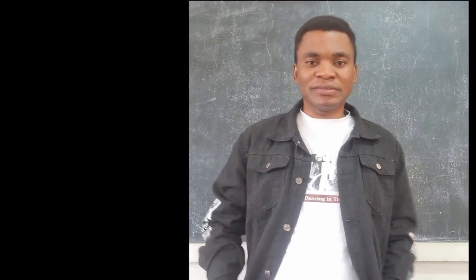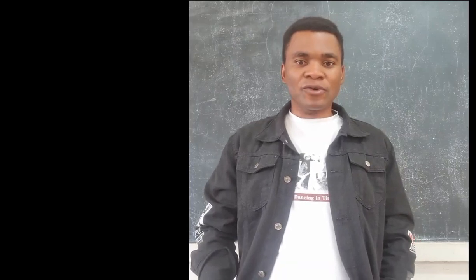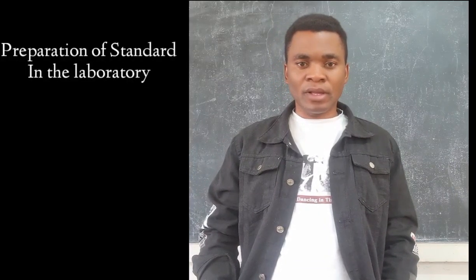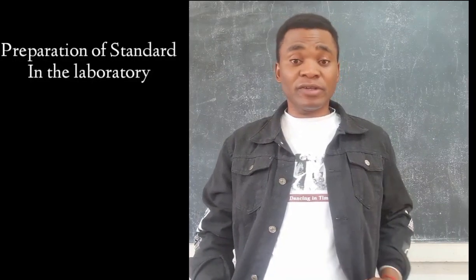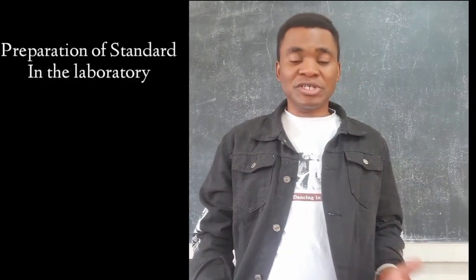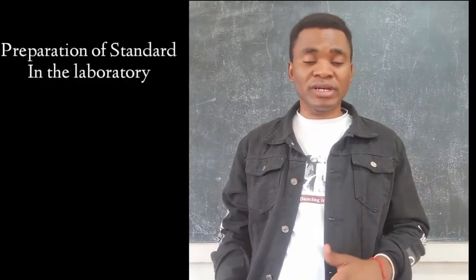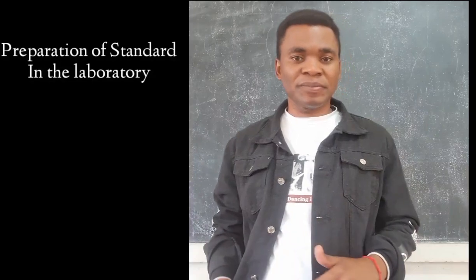Yes, hello everyone, I am Jula Mzungu, and today I'm going to teach you about the preparation of standard solution in the laboratory. This class is very important for chemists, laboratory technicians, and us teachers who are teaching chemistry at school because it can help you know how to make the standard solution in the laboratory.